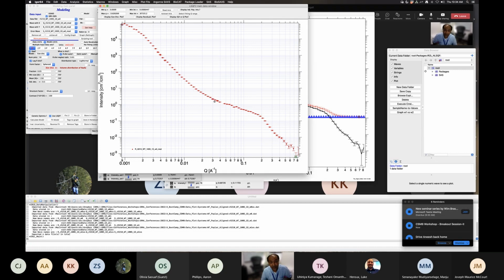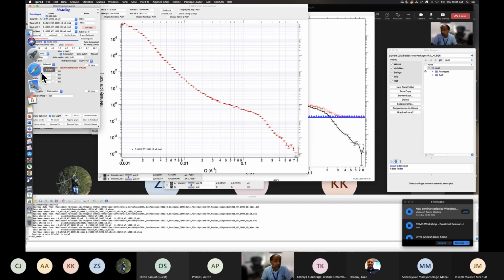So I bring my cursor back there, well, we don't need to, because we can just plot it and see how it looks. The first thing I do is I say, okay, 50 points is less. I want more. I'm going to put 200. I leave that as 0.01 for the tail. Distribution is auto. Yeah, I want it to be auto. I don't want to manually decide on those. It generates that from the information that I've given, and I want it to be a log distribution. Right now, I'm going to do log normal.